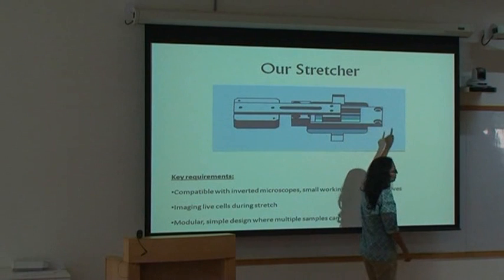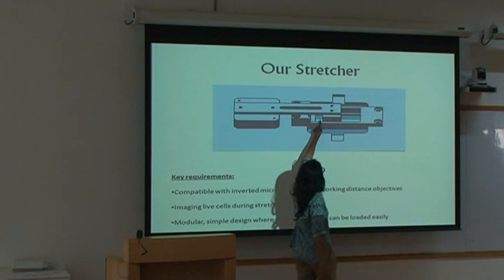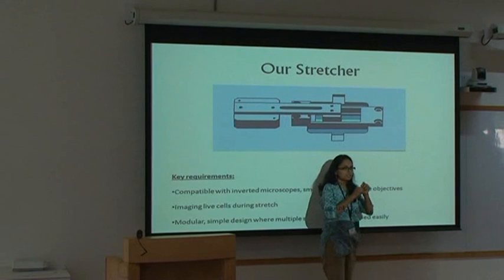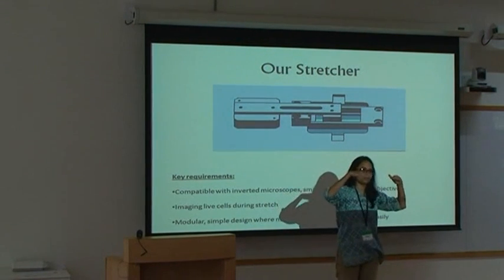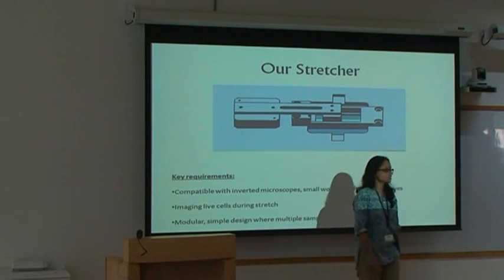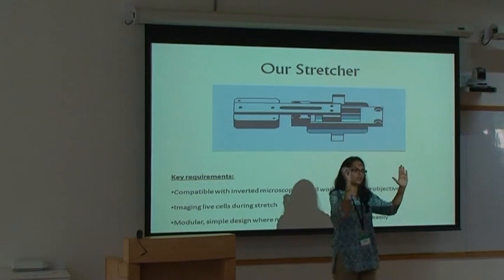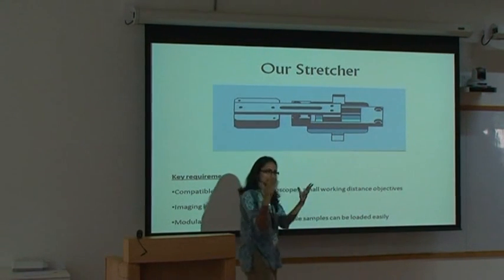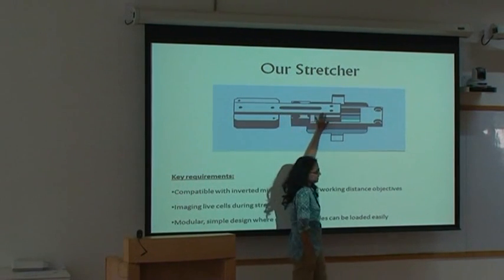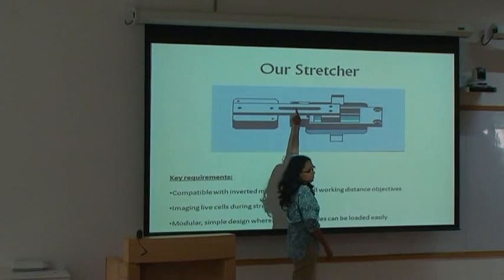This part is completely rigid. This is all connected. There's nothing mobile. This is the only part which is mobile. Okay, and between this and this is where you stick the PDMS on the bottom of it, not on the top. On the bottom is completely flat, and that's where you stick your PDMS. And when you move this part, naturally one part is kept fixed, the other part moves, and whatever is inside basically is uniaxially stretched.